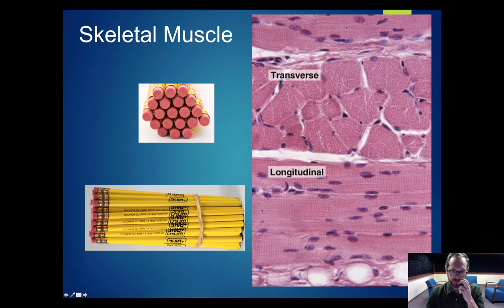Now, it's important that you can only really see the striations in this longitudinal section. They don't become as visible in this transverse section, but either view is fair game for a practical quiz. So make sure that in lab you're looking at both of these slide preparations.